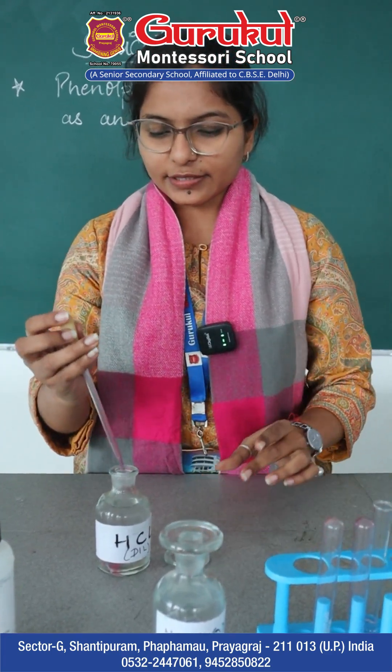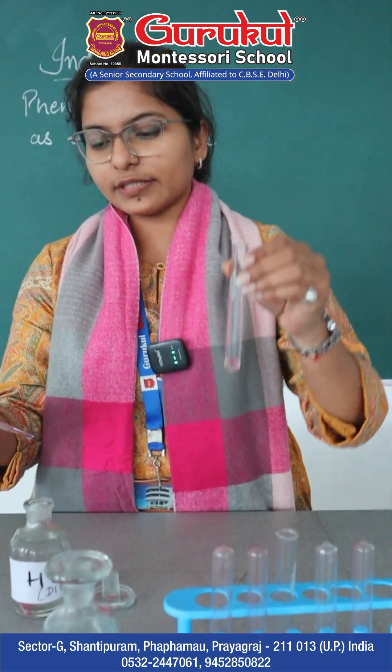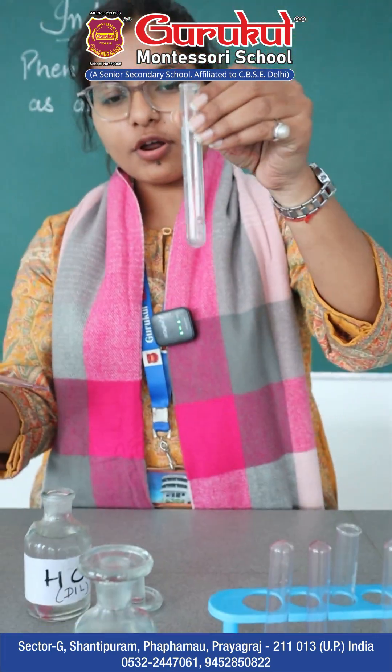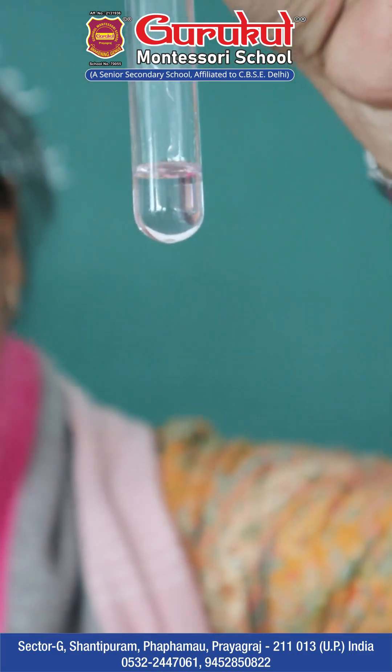I will take the HCl and slowly add it into the first test tube. On mixing, can you see any changes? No — it is still a colorless solution.